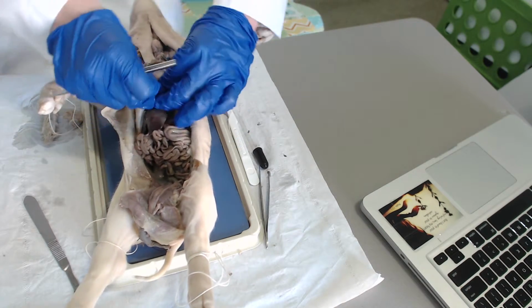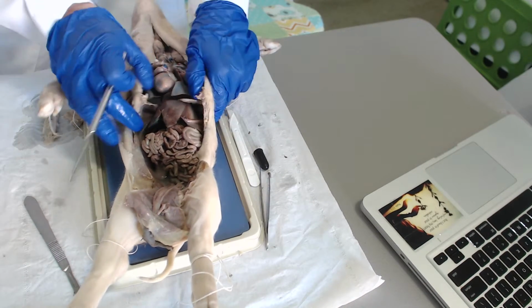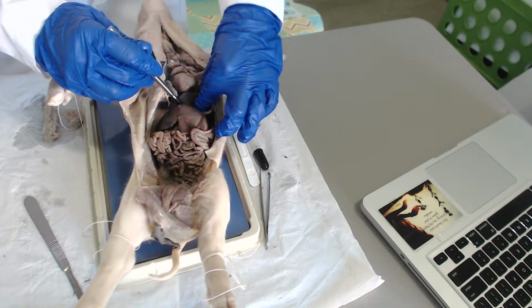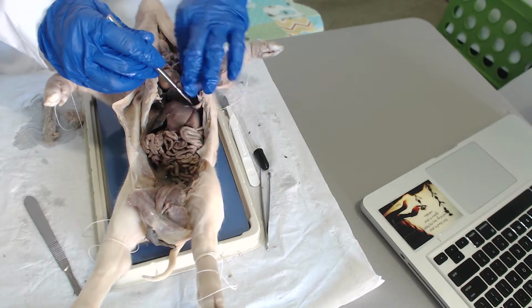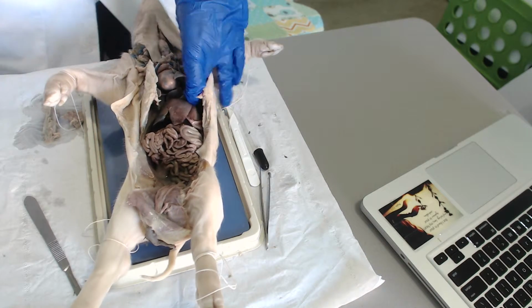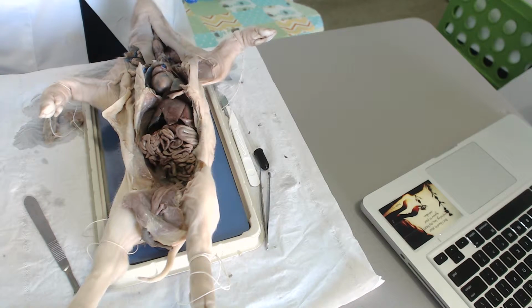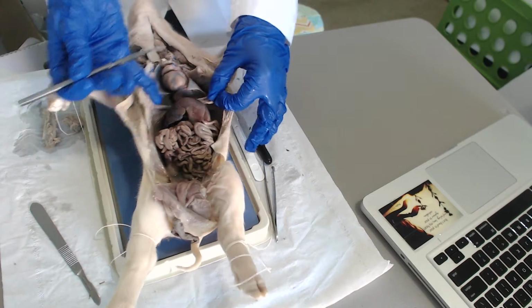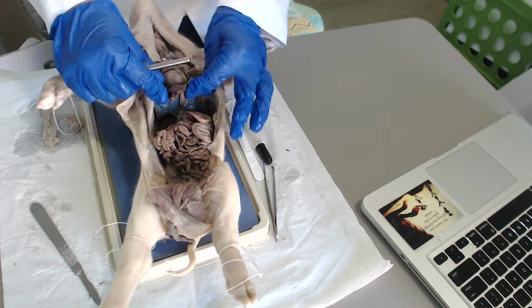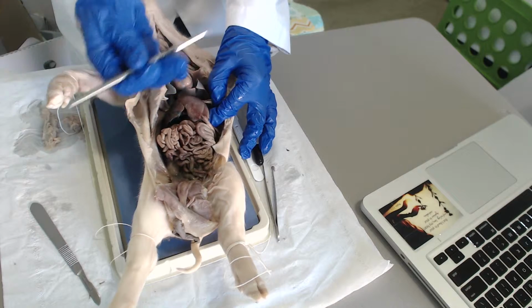Okay, so now we go to the diaphragm, and the diaphragm is this muscle, actually the cavity right where it separates from the abdomen. It's this muscle that you had to cut through and kind of had to split in order to dissect. But this muscle tissue right in here is the diaphragm, and that's what opens up our lungs and helps pull air in. The liver, okay, so the liver is very prominent. The liver is actually right here, and you have different lobes of the liver, as you can see.